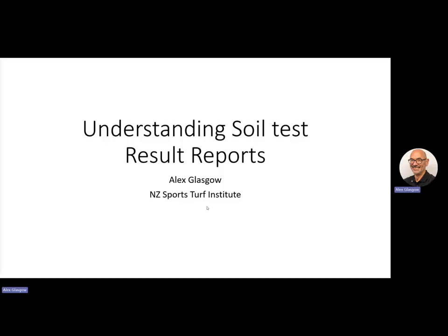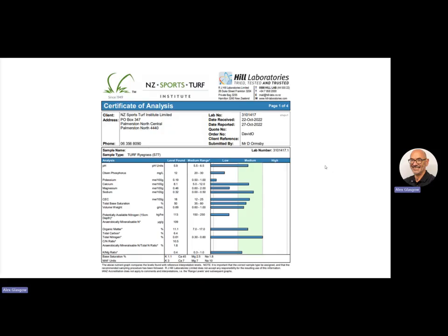Today I'm going to be talking about some aspects of soil test results reports and what they mean. So I've got a soil test result sheet here. This is from Hill Laboratories, which is a large lab, very widely used in New Zealand, including in the turf industry. They do a lot of different tests, and like I say, they do a lot in the turf industry. So what I'll just do is go through some of the aspects of this test just to explain what they mean.